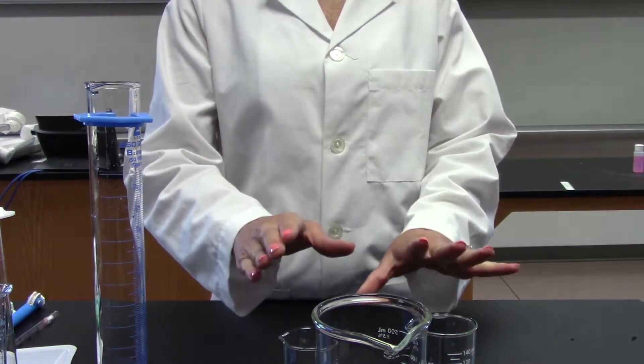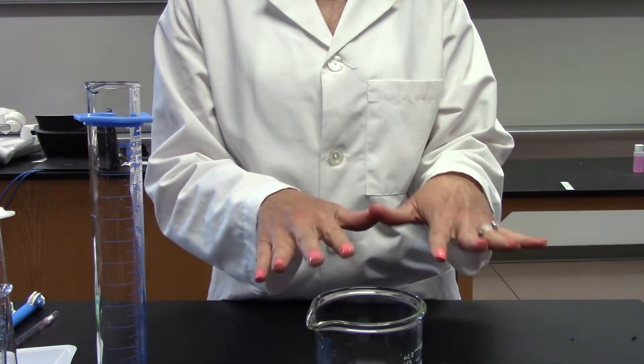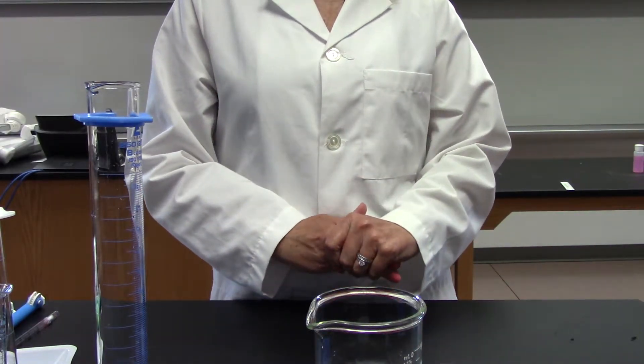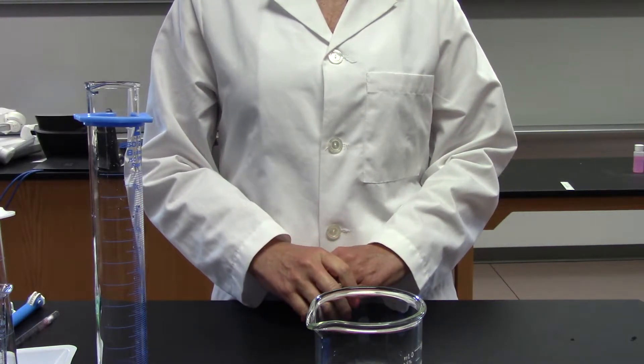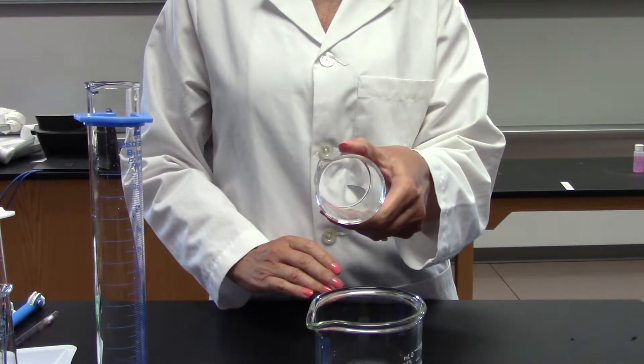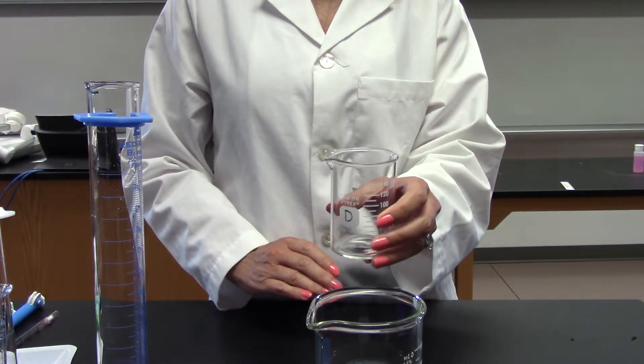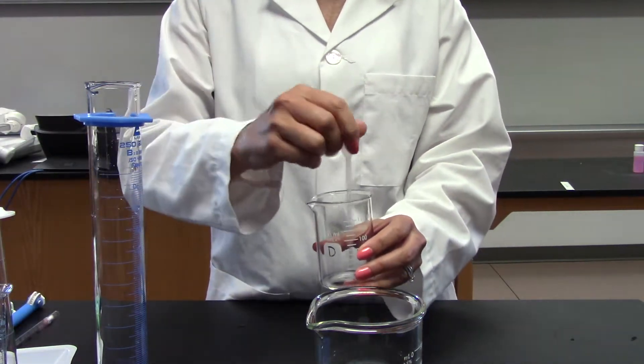I'm going to start with these beakers. I have just three sizes out today - these come in a variety of sizes, different volumes. Beakers are a great vessel in which to conduct an experiment. They have a nice wide mouth, so it's easy to add materials to this beaker, remove materials, and stir.